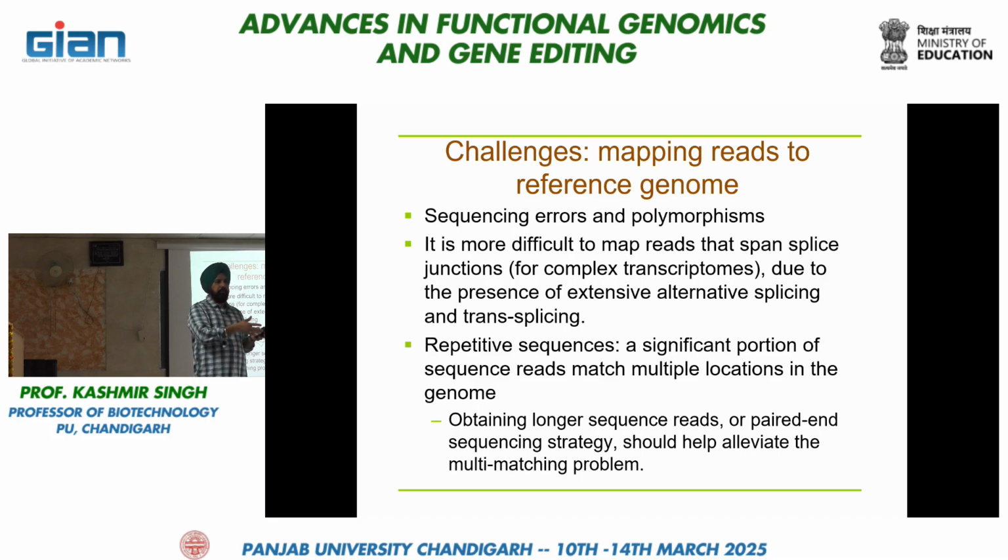You take a reference sequence. If we are working on plants, then Arabidopsis, rice, and 3-4 more plants you can take. You can take their sequences and then align with your data. Okay, and all the genes of that category will come out. Suppose you have 25 sequences of that, or 100 or 200, sometimes you have 700, 800 sequences of one gene family. All these things will be clustered together with the reference genome.